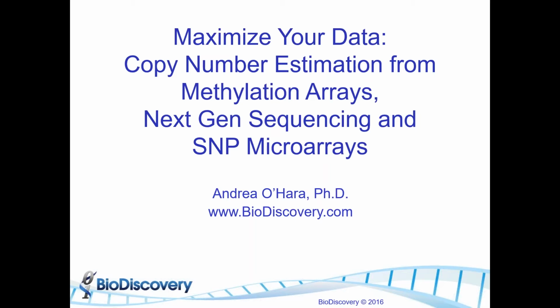Thank you. So today I'm going to be talking to you all about how we can maximize our data. So what are the different sources of data that we can use for copy number estimation? How can we input them into Nexus Copy Number 8.0? And then what sort of results can we expect?